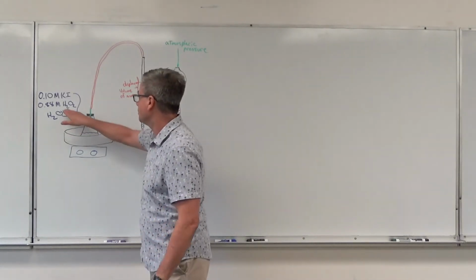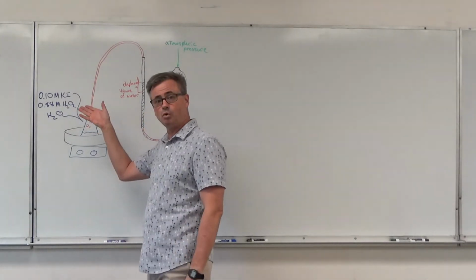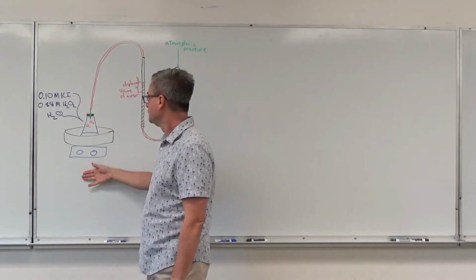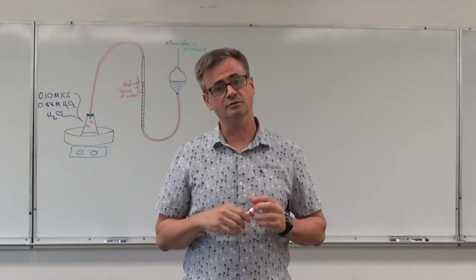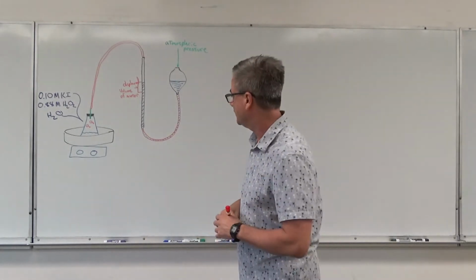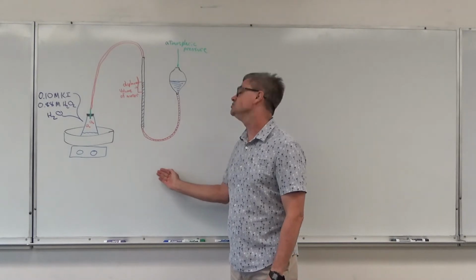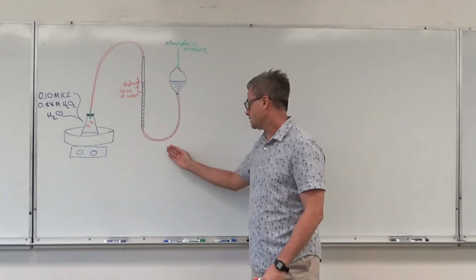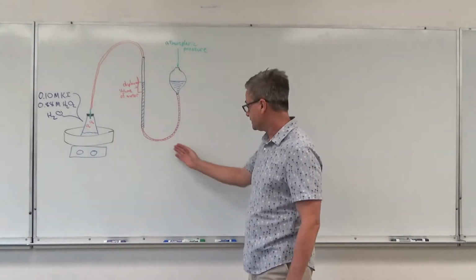All we have to do is take our original moles of hydrogen peroxide minus the moles of hydrogen peroxide that was consumed, and then we have our new moles. The volume in here never changes, it's always 0.06 liters. And so we have our new concentration, and we can do that for every 30-second interval. So as the concentration of hydrogen peroxide drops, we can collect that.